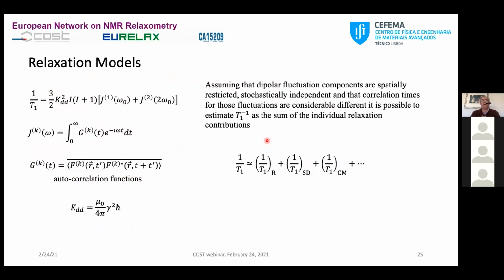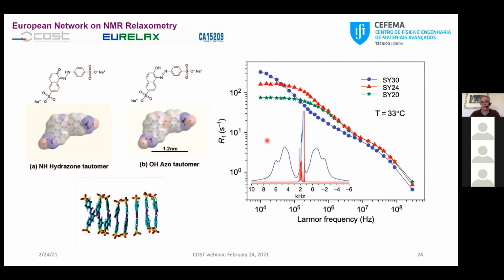We can look at the dispersions like the ones here. We can use a model-free approach and say, well, let's give it a go and imagine two or more BPPs, or even a distribution of them, and let's characterize and make a distinction between what happens with temperature or whatever other parameter just by looking at this. And this is possible. It's a possible approach, but it requires some statistics. It requires a lot of measurements before we can come to a conclusion.